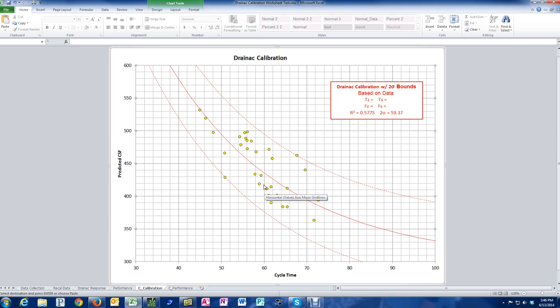If, however, you notice that you were consistently out of that range, or let's say that they were always on one side of the line, well, that might be a reason to go in and recalibrate. Now, the reason that the spread is so wide in the first place is just because the TAPPI 227 methodology has a degree of uncertainty associated with it. This is just a fact of that test.